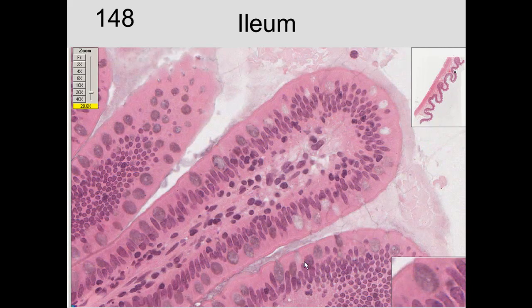A little higher magnification shows you the intestinal absorptive cell. Indeed, it is a column. As we see there, this is the nucleus. Nuclei are from more than one cell. There's a goblet cell, and there's the brush border. You can see this kind of little fuzzy thing right in through there, or glassy looking thing. That's the brush border, and that goes all around the cells that we see in through there. The brush border continues. There's no brush border over the goblet cell, as we see it discharge in through there.